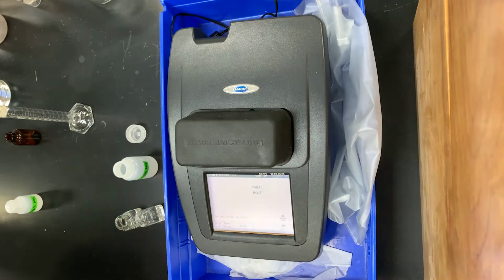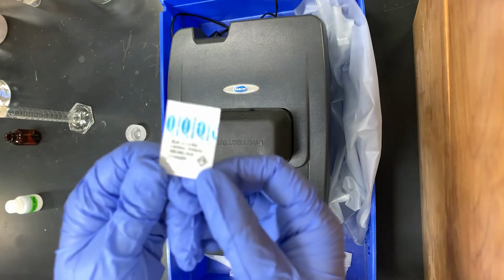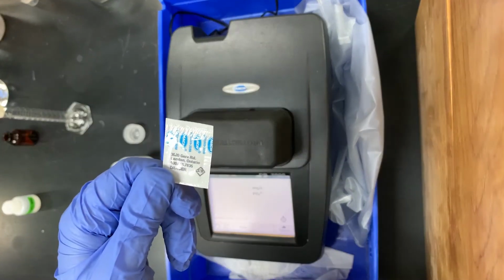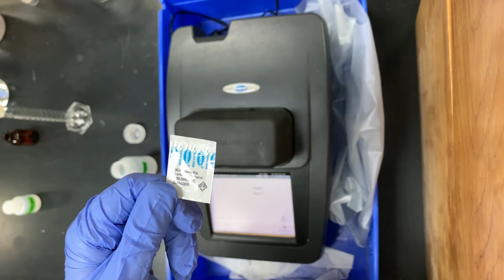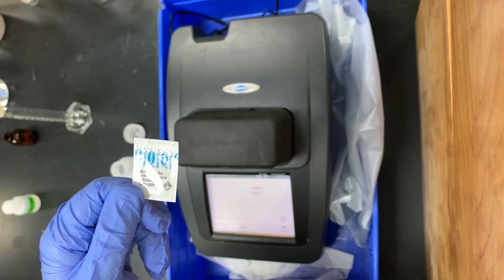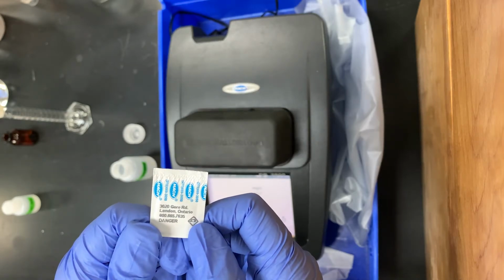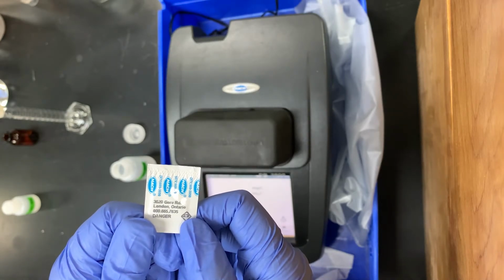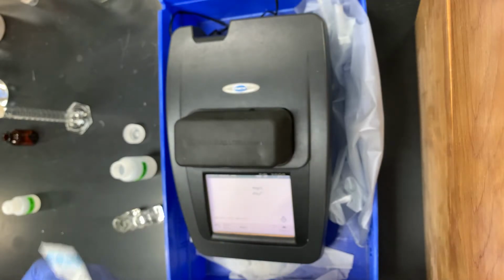So now that we have added 10 mils of sample into each cuvette, we will be taking one of these powder pillows here, which is just our reagent. This method essentially uses the same principles as for the standard curve we made in the last lab with our liquid reagent. The ascorbic acid is still the main active ingredient in the reagent, as it reduces the phosphate.